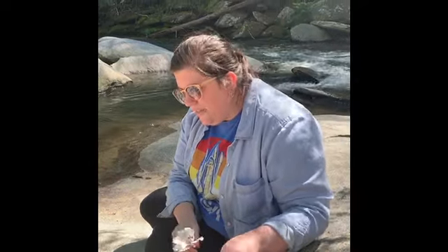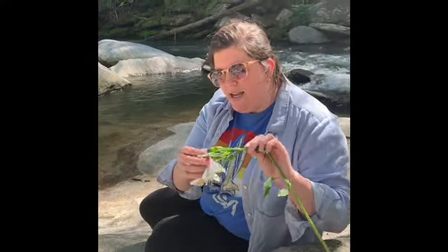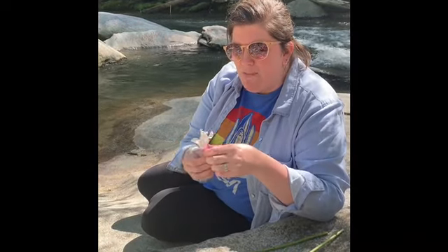Let's see if there's one that has a little bit more to it on this particular kind of flower. But you can kind of see where this little green part is coming up. Alright, and that is called the sepal. And that is the part that protects the bloom itself from the wind and other damage. So you have the sepal, and then you have, of course, the petals.